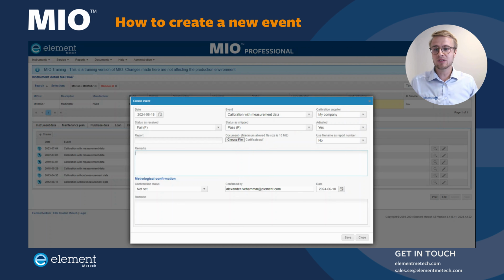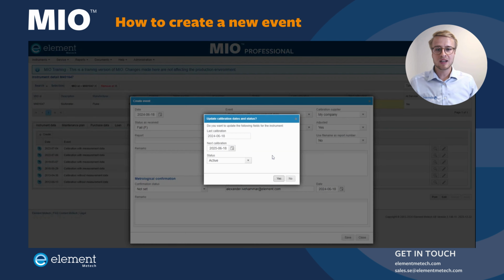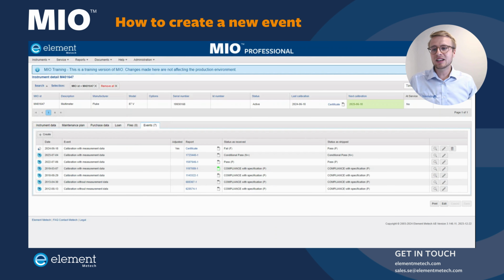You can then easily upload your certificate for the event and create any type of special remark. I'm now going to click save, and then you will get the option to confirm the next calibration date, which is based on the calibration interval. I'm going to click yes here, and then you can see that this calibration event has been registered with a report attached to the instrument.